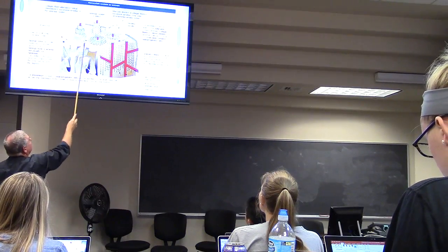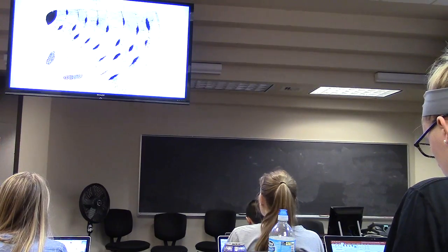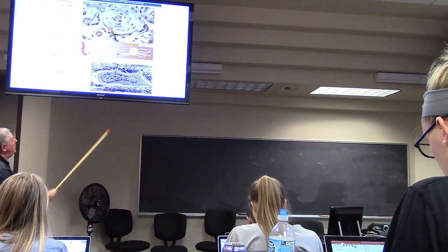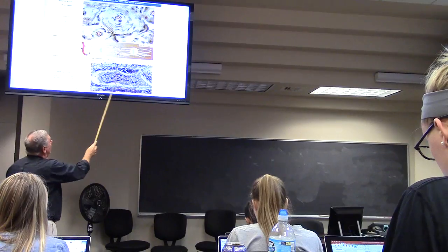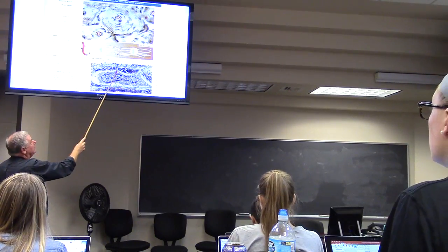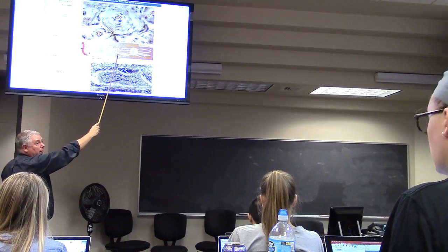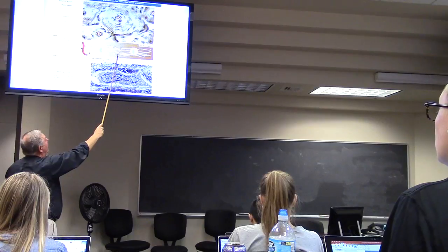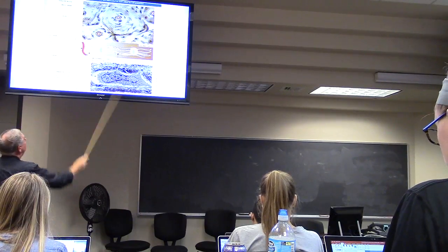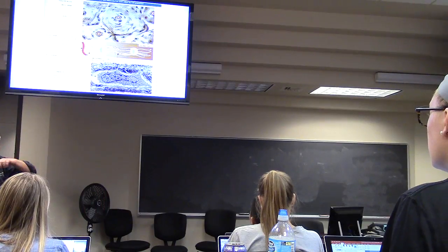And each one has a cement line around it. Sort of isolates it. Here's another picture. You can see that osteocyte floating in the lacunae with its little processes entering the canaliculi, touching each other. So that's how you get the exchange of nutrients.